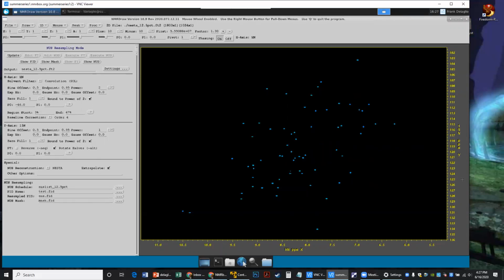So when you show someone a result like this and say, if you could do this with 12%, you could be pretty comfortable at 40 or 50%.